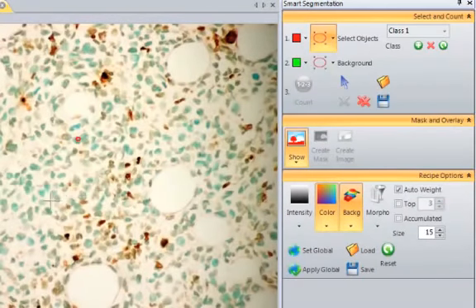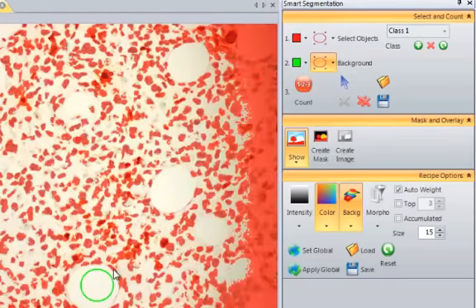It selects everything that's going to be the same shade of blue. I select a few just so I've got some representative samples. Then what I'm going to do next is select a background. If I click the background region here and click and drag on the image, same as I did with the object selection, as soon as I do that, you see it's going to have two different types of objects.